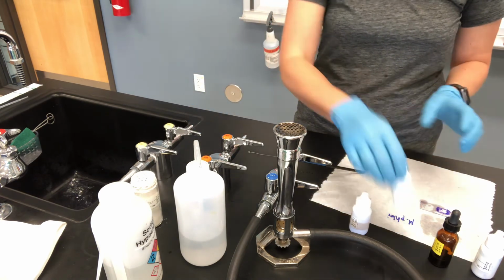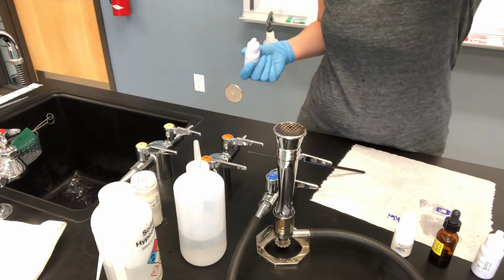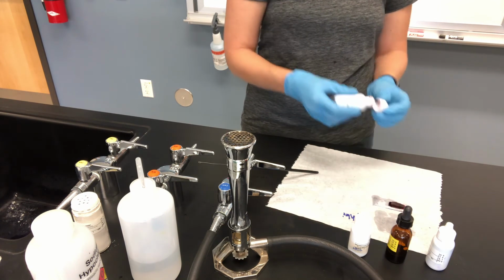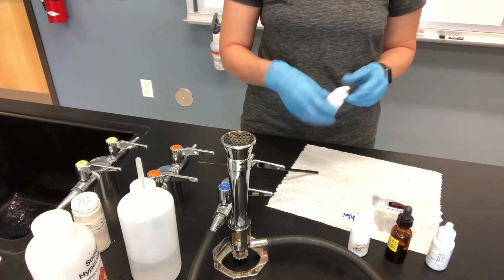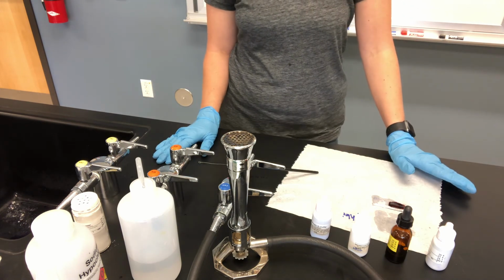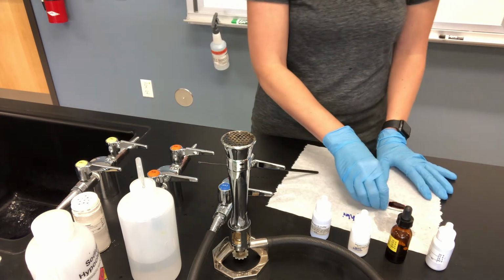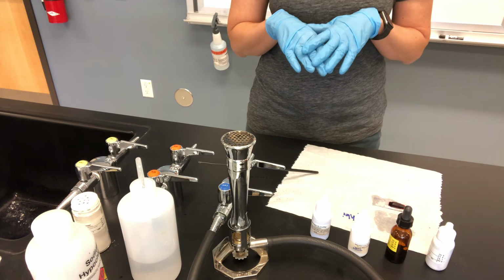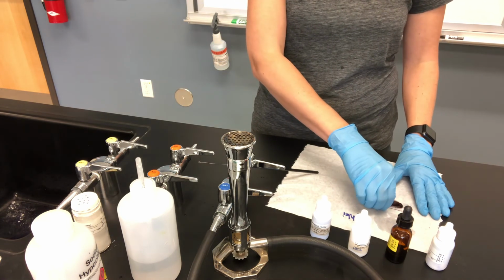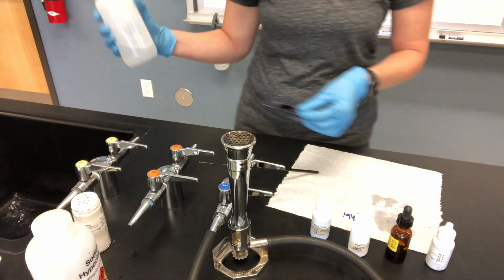So then the last step is going to be safranin, the pink stain, and that one can go on for just a minute. You flood the stain, and you'll notice I did not blot dry in between each step. So you put on the next step right onto that wet slide. You only have to blot dry at the very end. Okay, so safranin goes on for a minute, and you do these four steps for every kind of bacteria. You don't mix and match. Whether it's gram-positive or gram-negative or a mystery, every bacteria gets all four of those steps.